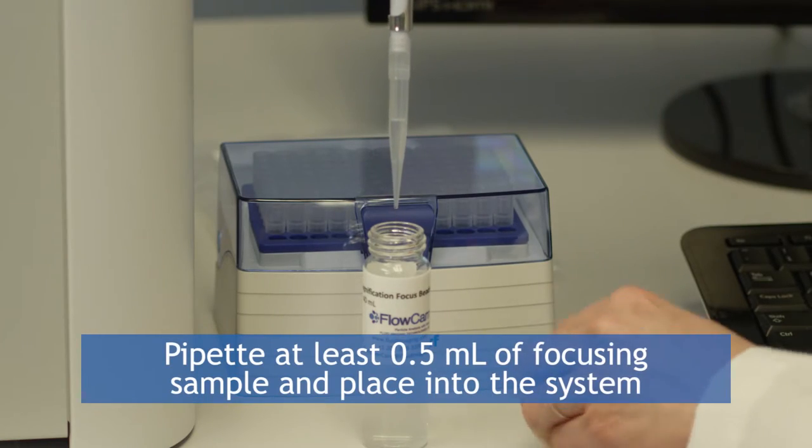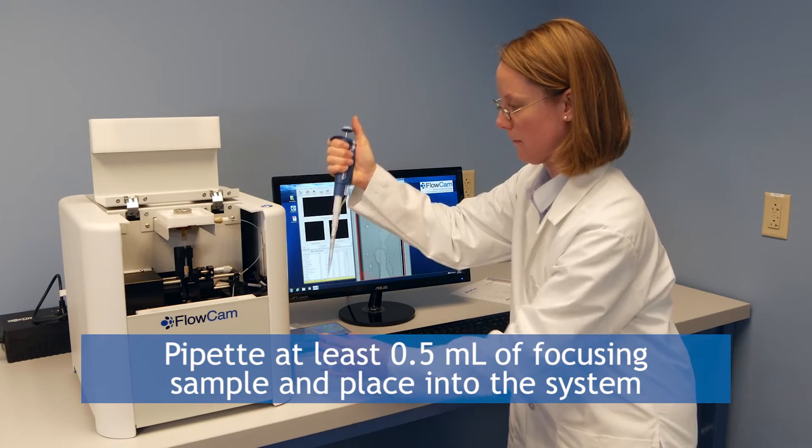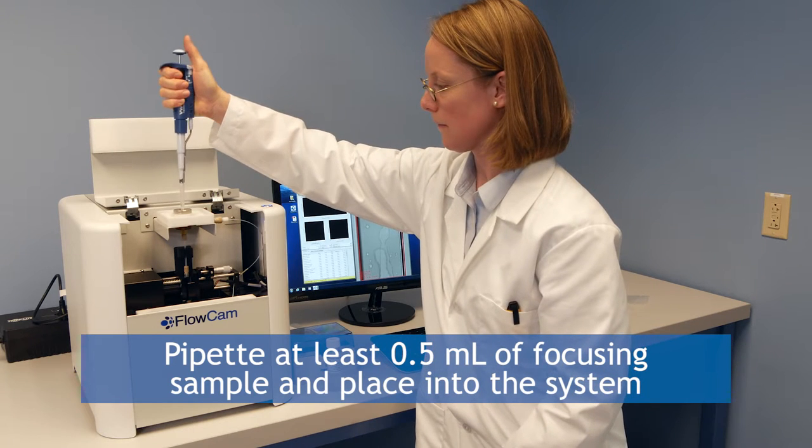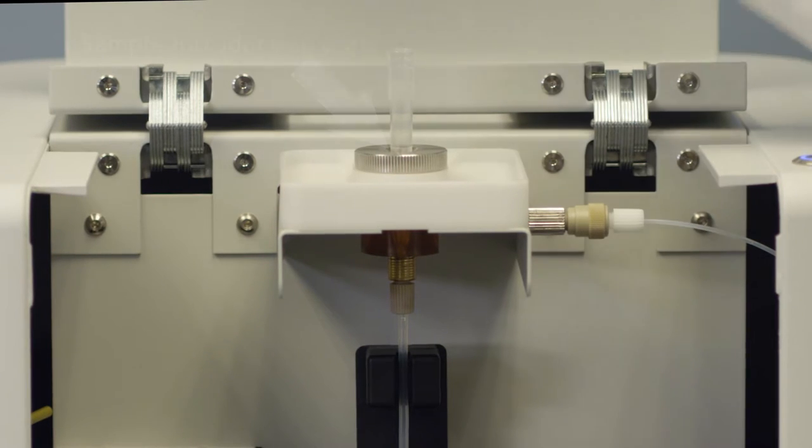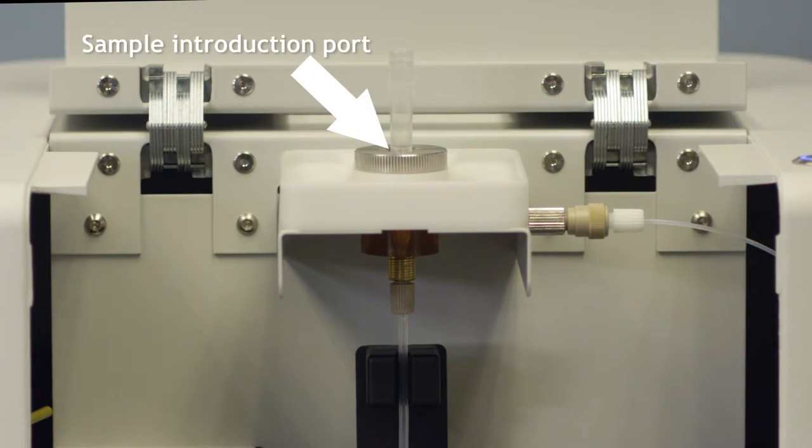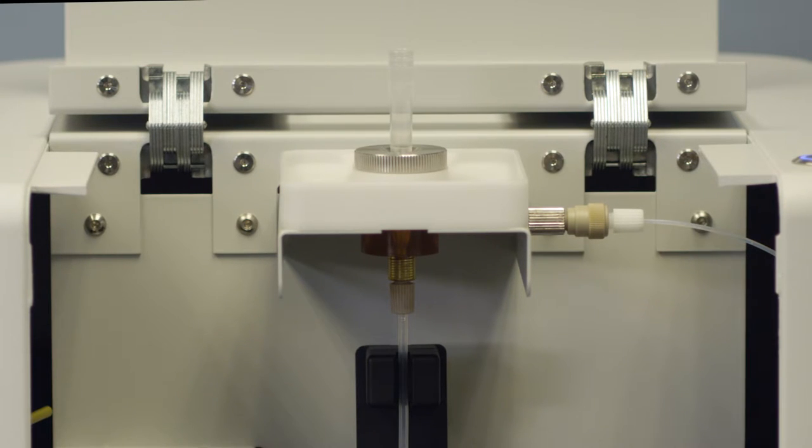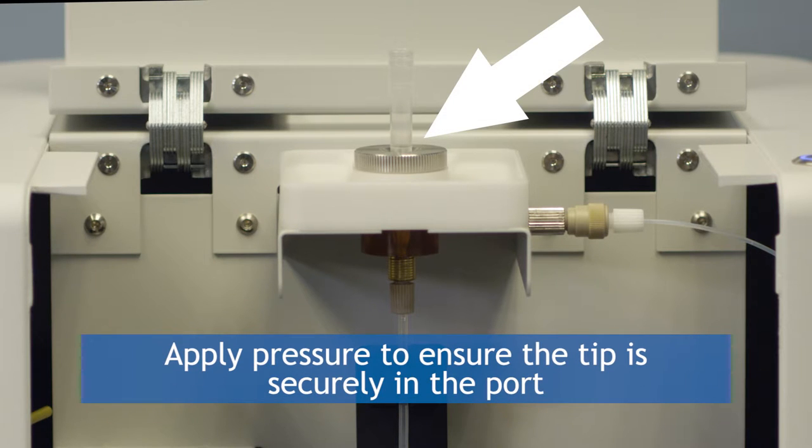pipette at least a half a mil of focusing sample and place into the system as shown here. Note that the pipette you use should be inserted right into the sample introduction port and left there using a pipetter that has an appropriate ejector. When leaving the sample tip in the system, make sure you apply some pressure to ensure the tip is securely in the port to prevent air from improperly being drawn into the system.